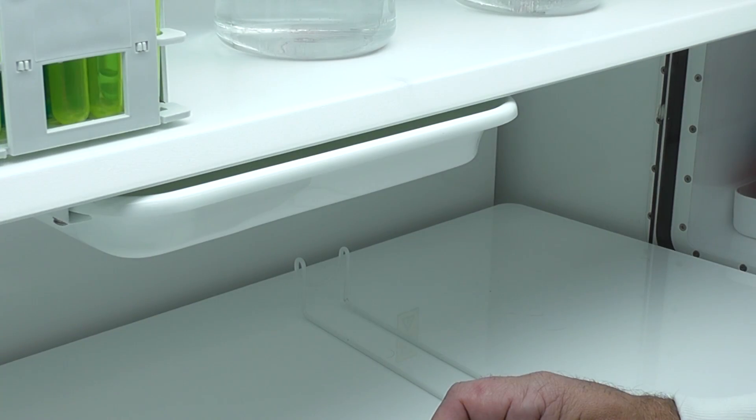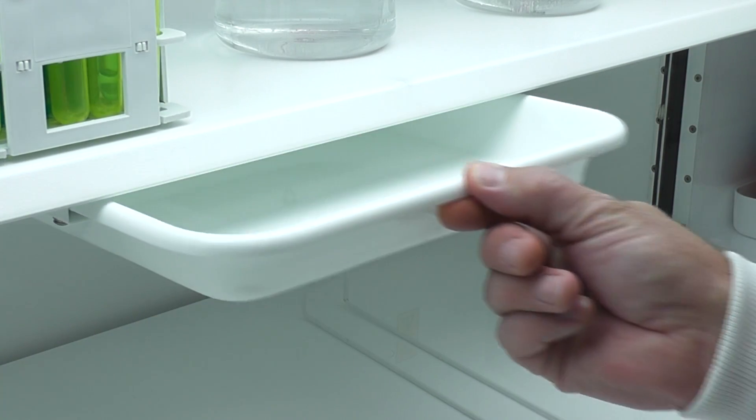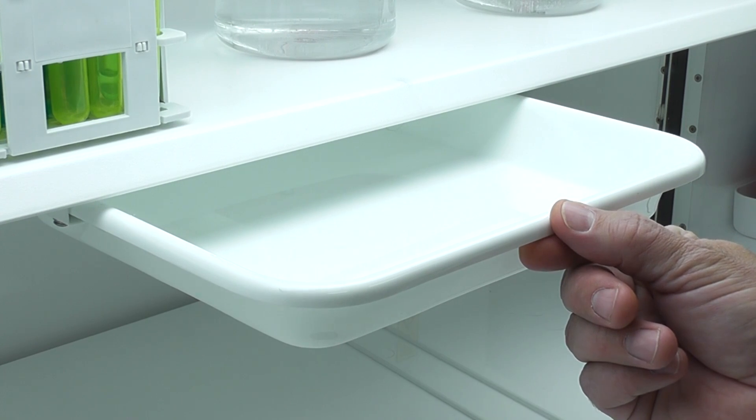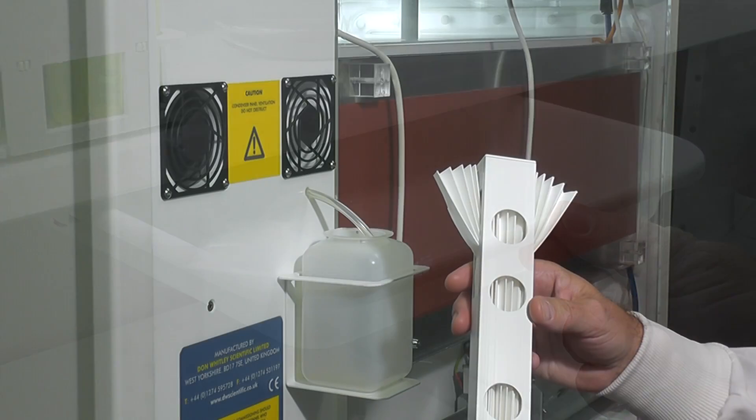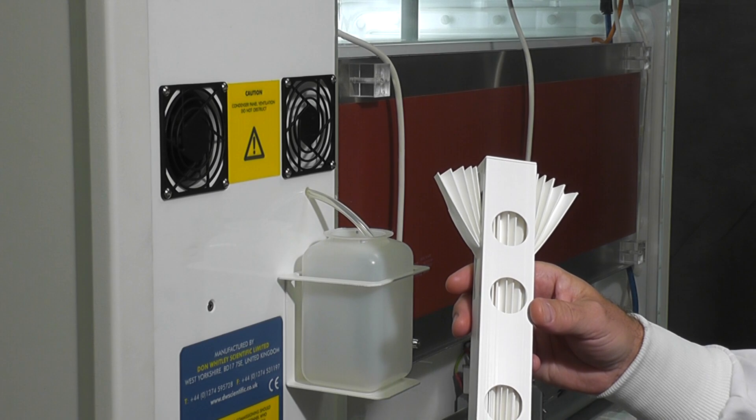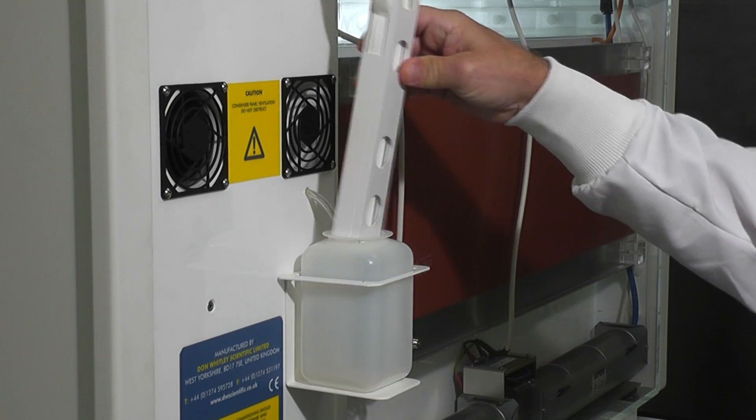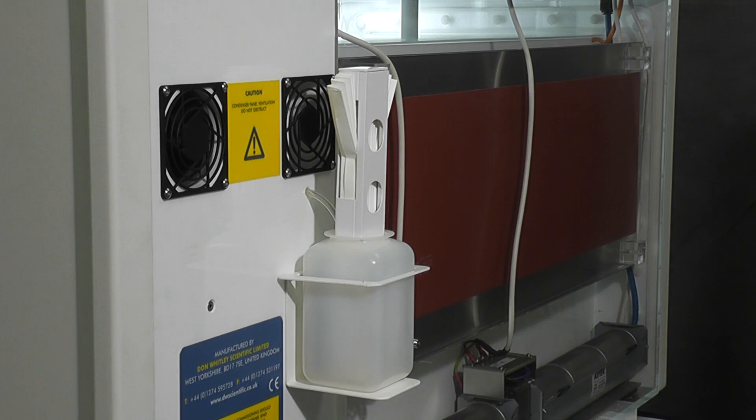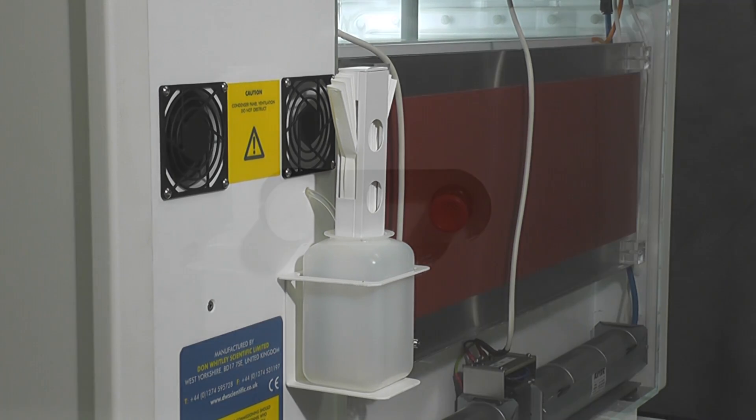One or two storage trays can be positioned under the shelf. This is either a factory fitted option or trays can be fitted on site. The dehumidification system automatically removes excess moisture to a reservoir outside of the workstation. Water collected in the reservoir is evaporated via bacteriostatic wick.